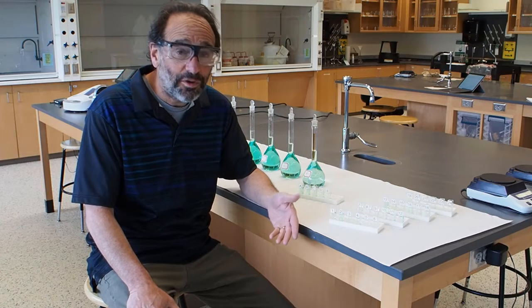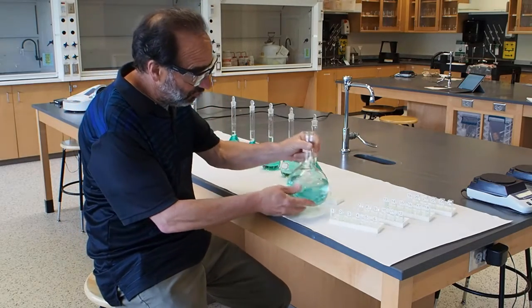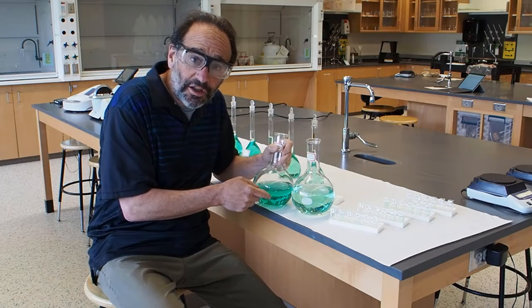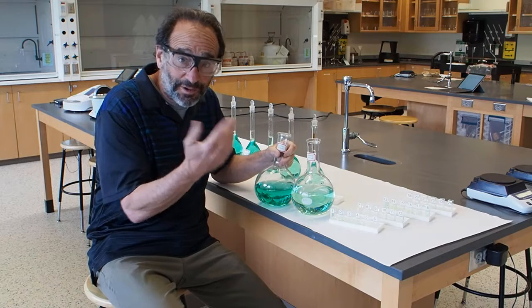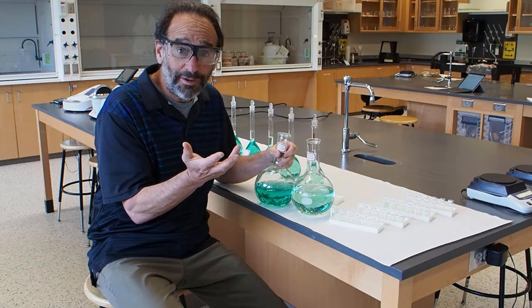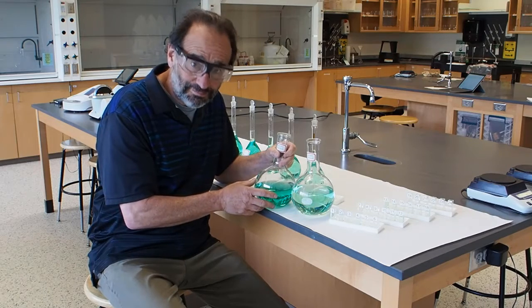And the way we're going to do this is we're going to use the property of nickel that it absorbs some visible light. I have two samples of solutions of nickel here that I made up, and you can tell that they are different concentrations because one's just darker than the other. This one clearly is darker green than this one. From that, we can infer, and correctly so, that the concentration of nickel in the left-hand sample is greater than the concentration in the right-hand sample. And that's really what we're going to be doing. We're going to be looking at how dark a solution is and relating that to the concentration of the samples that we're going to be trying to analyze.